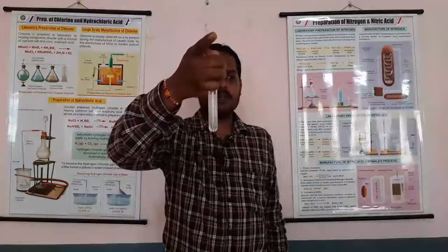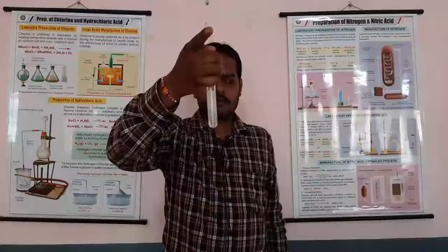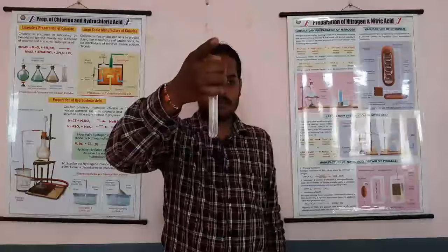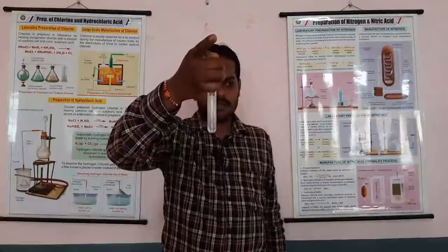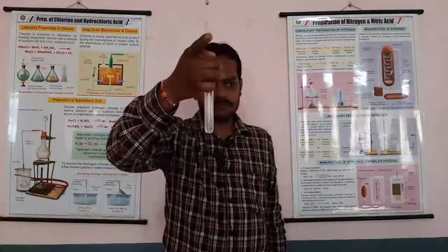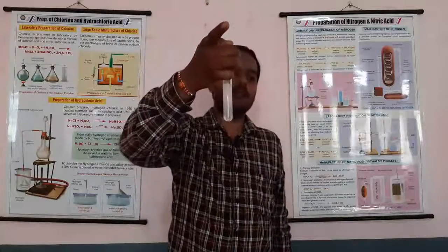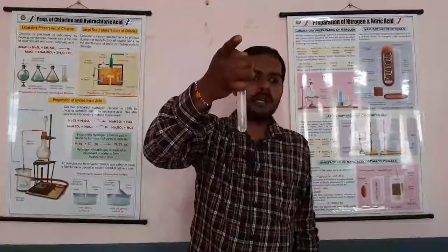You can also do the pop sound experiment here: when we place a burning candle in front of the mouth, we can hear the pop sound. So, this is the evolution of hydrogen gas when zinc reacts with acid.